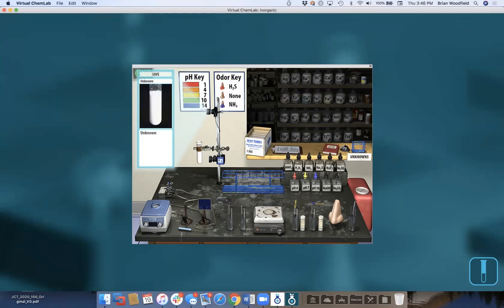I add the chlorides, centrifuge that, add heat, centrifuge again, then decant and see if I have lead. I don't have lead, so I take off my heat. Now I go to pH 7 and add ammonia. I don't see mercury, but if I acidify this, I get it back, so I know I have silver. So I just did a qual scheme for lead, mercurous, and silver.